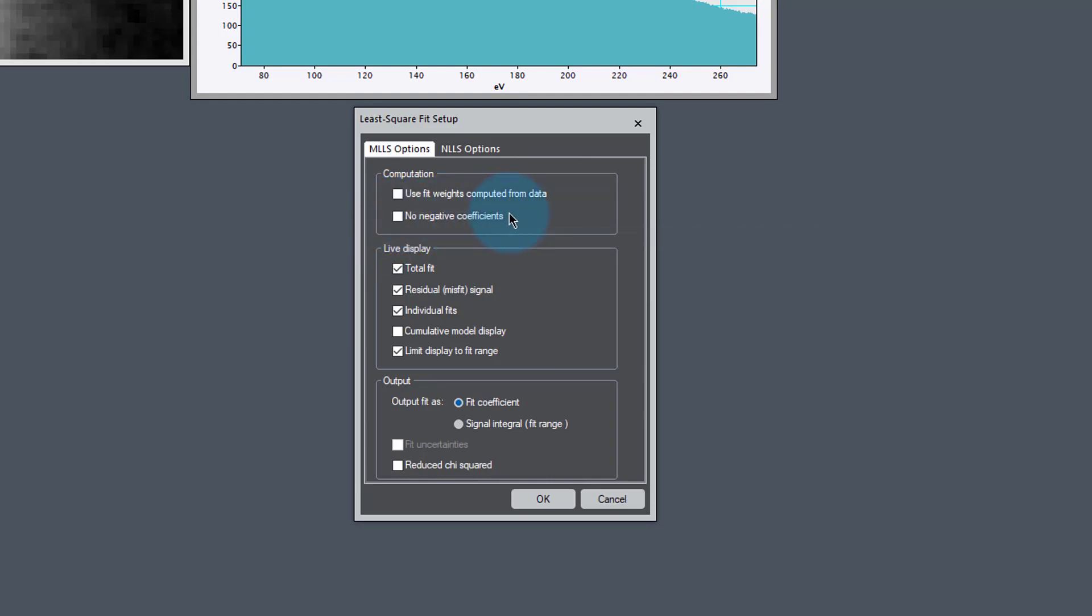For computation, let's use the fit weights computed from the data. That means all of the data values will be scaled by their uncertainty. By doing that, we ensure that the high intensity signals don't dominate the weaker intensity signals simply because they have more intensity. This scales everything by its certainty.